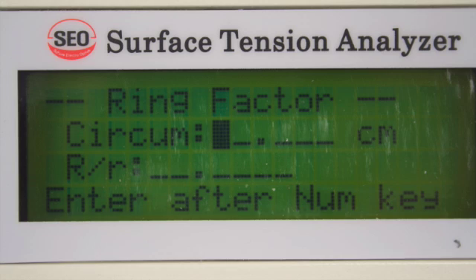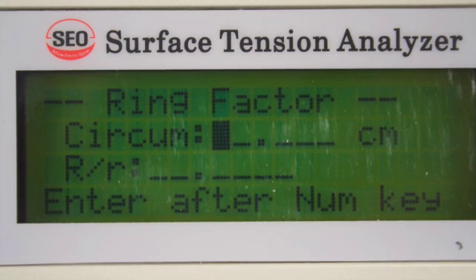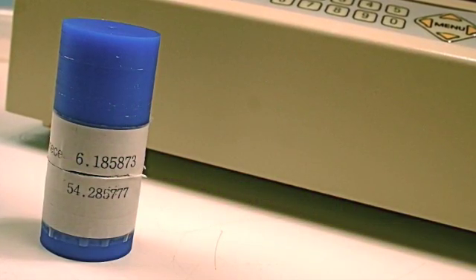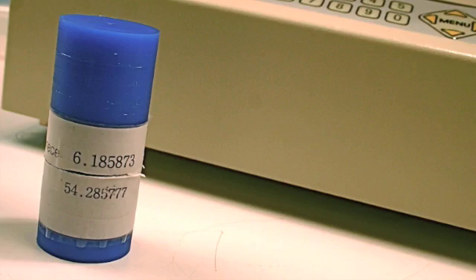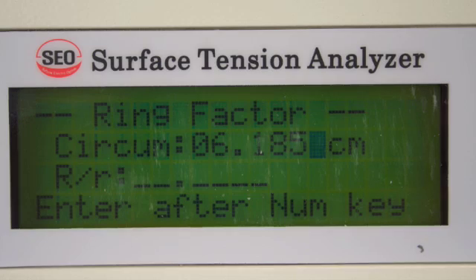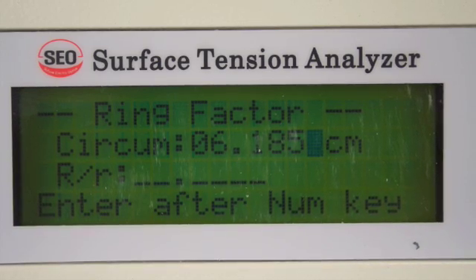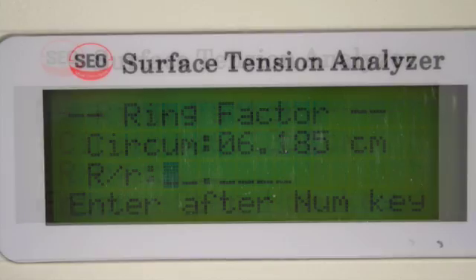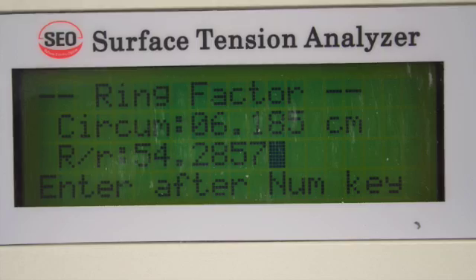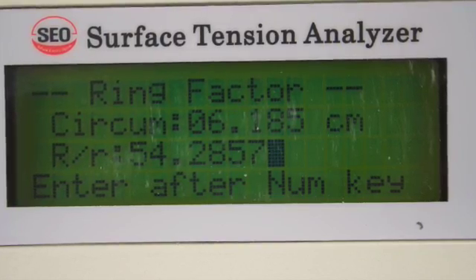Selecting the Denoy ring method cues the operator to enter the ring factors. From the label on each Denoy ring, these factors can be found. Simply enter the circumference and press ENTER. Next, enter the R factor and press ENTER.